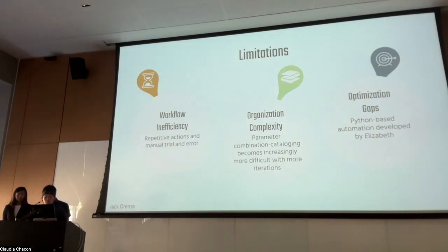Although manually performing the refinements improved our understanding of the GSAS-II workflow, it also exposed several inefficiencies. Refinement required repeatedly selecting parameters, running the fit, evaluating the results, and making additional adjustments for each of the three alloy systems. As the number of trials increased, tracking which parameter combinations had already been explored became increasingly difficult, making the process both time-intensive and prone to overlooking potentially better solutions.